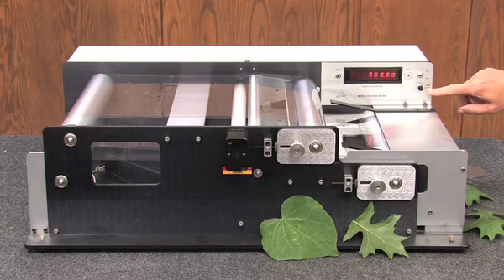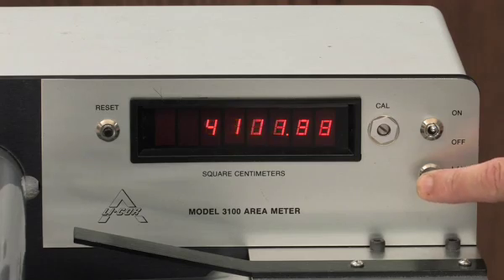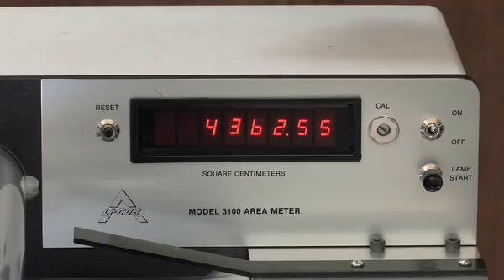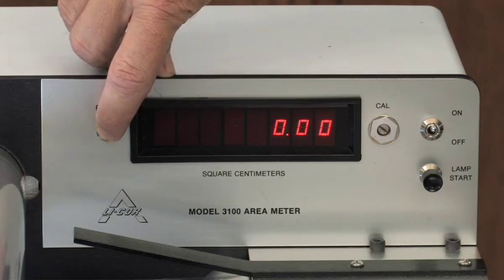Next, depress the lamp start button and briefly hold it in. When the bulb begins to glow, release the button and the entire lamp will start up. Finally, press the reset button on the control panel to clear the display.